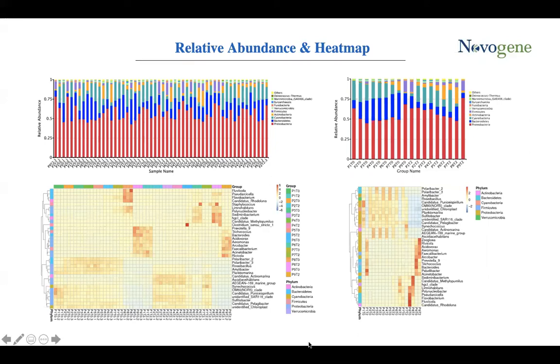The results will be shown in these two heat map figures, plotted with sample name on the x-axis and the genus on the y-axis. Here, the absolute value of z represents the distance between the raw score and the mean in units of the standard deviation. That means the redder the color in this little box, the more this phylum is clustered in the sample, and vice versa.